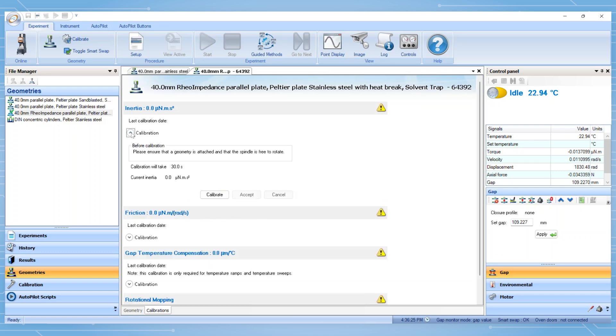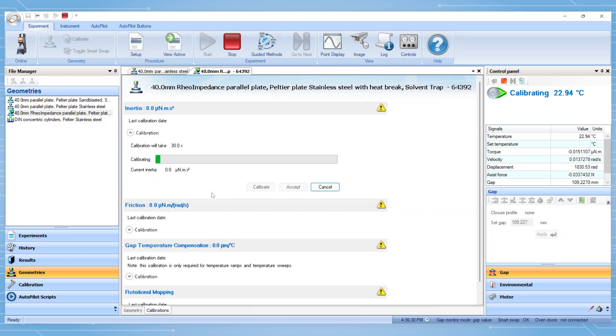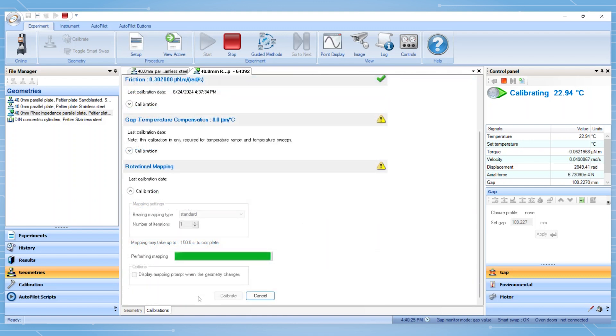Perform the geometry, inertia, friction, and rotational mapping calibrations. Gap temperature compensation should be performed before temperature ramps and sweeps.